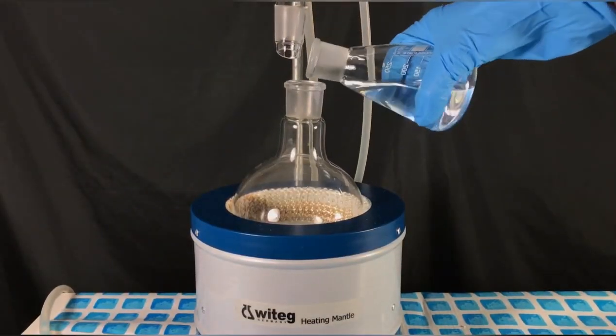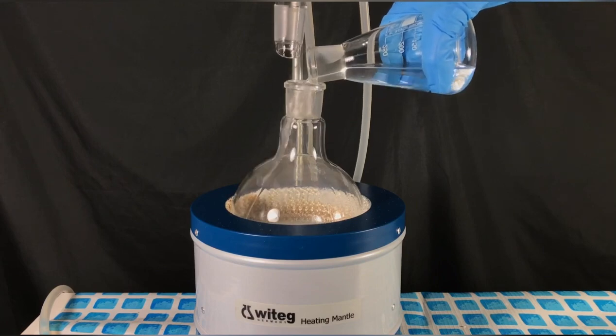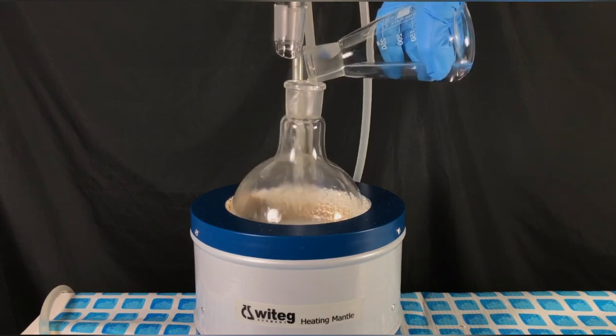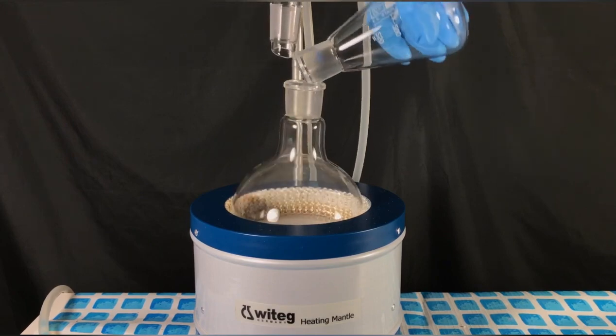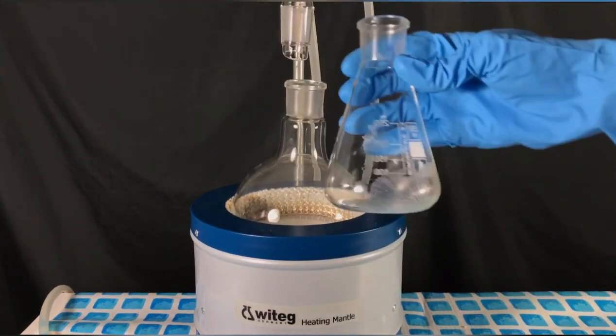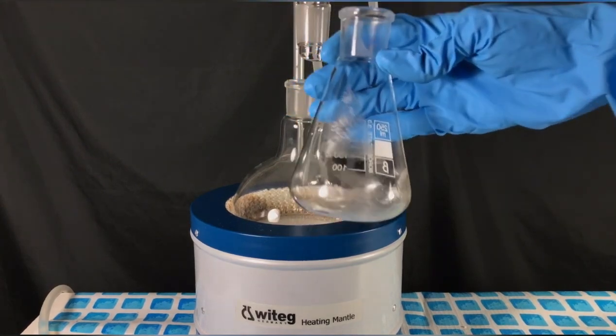The hot urea in ethanol solution was added to the 1 liter round bottom flask. Now look closely at the Erlenmeyer flask. What's interesting is that upon cooling, those nice urea crystals formed on the wall of the Erlenmeyer.